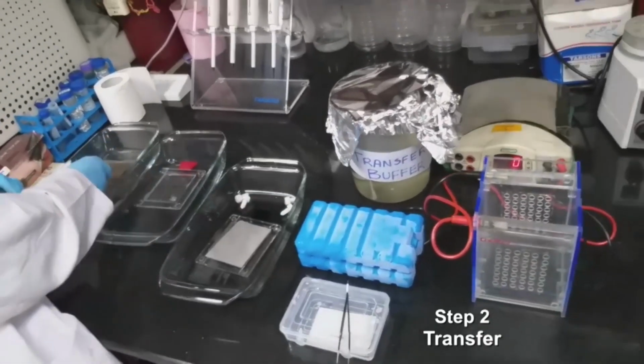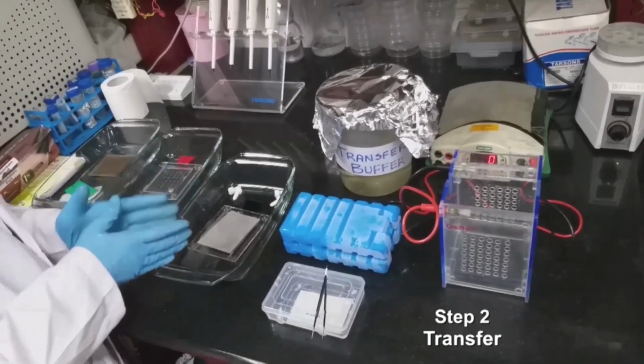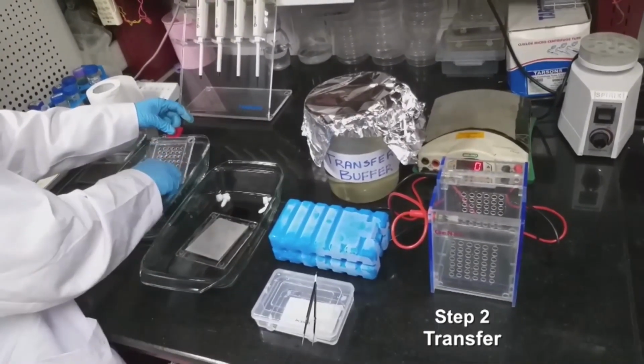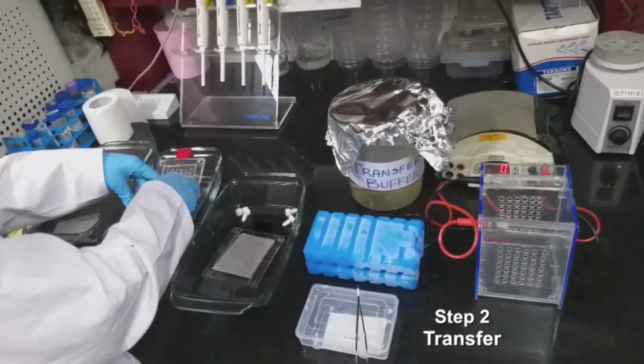Once you have inserted the blotting sheet, then you have to keep your gel.